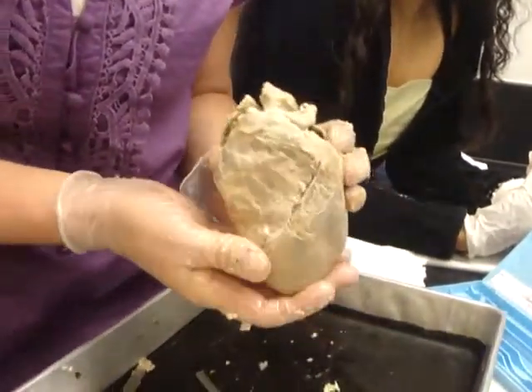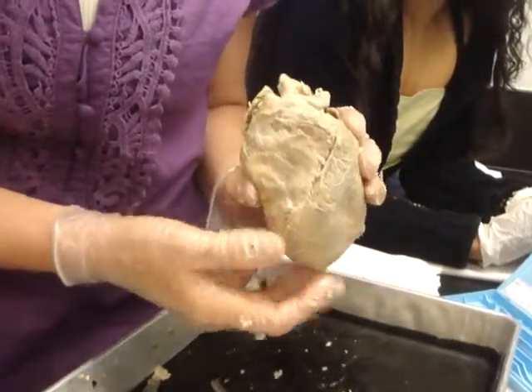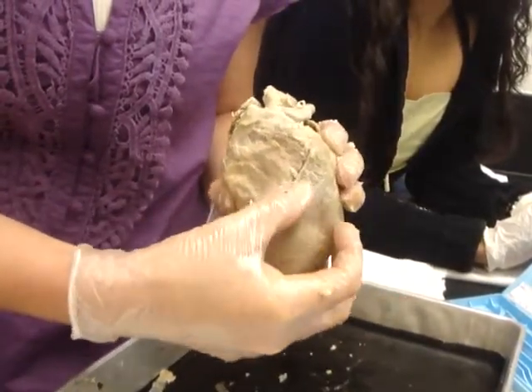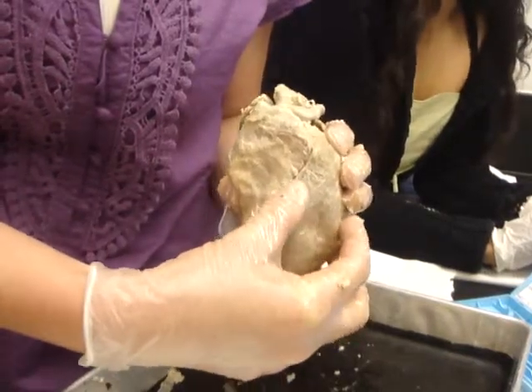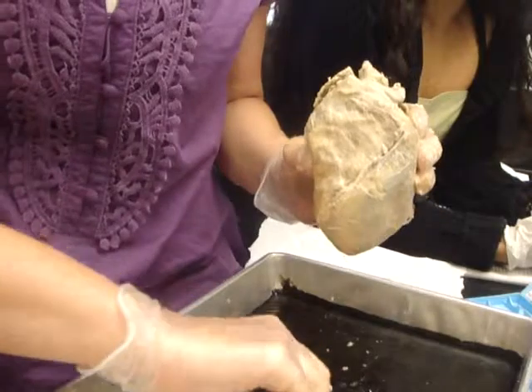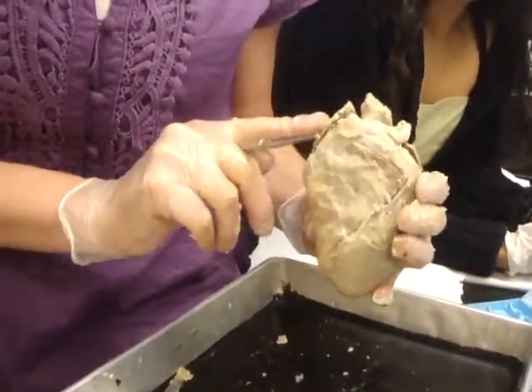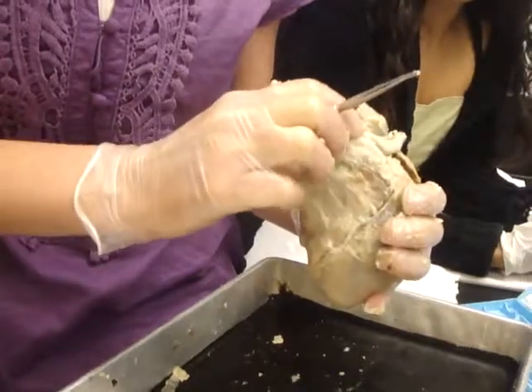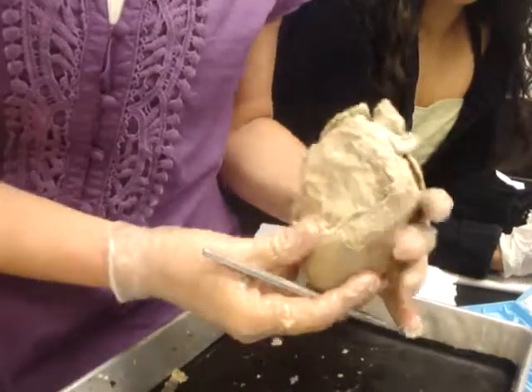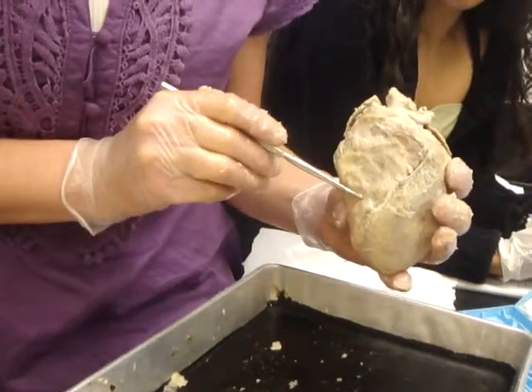This is the anterior view of the sheep heart. You can tell just by feeling it — this is the left ventricle, because the muscle is a lot thicker. This right here is the right auricle, and it sits on top of the right atria. This is the right ventricle.